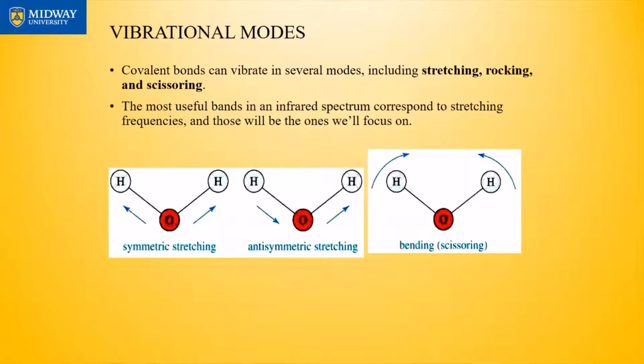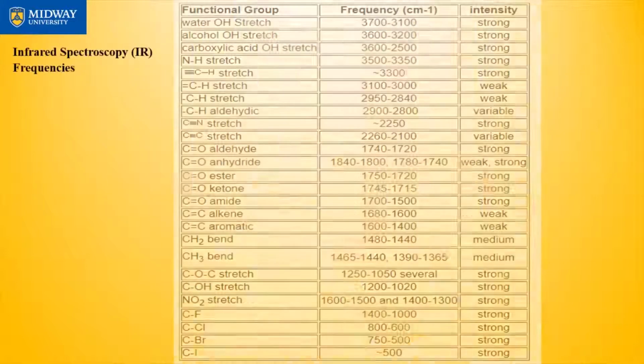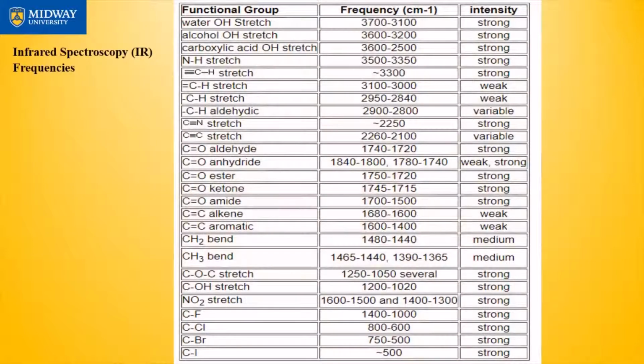on an output form, right? So here's a list of tables that people have compiled. We will come back to this in a separate video. I don't want to go into this in this video, but as you can see, people have done research over the years and have collected a database of values. As you can see, a double bond C-H has a frequency of 3100 to 3000. It's a range, it's never perfect. We will go into detail.